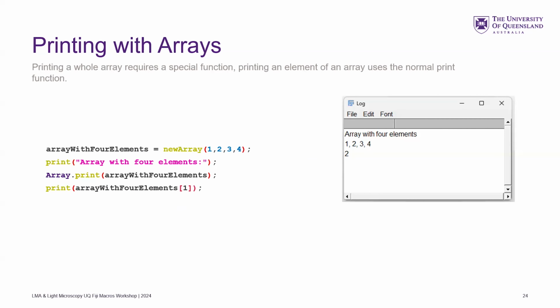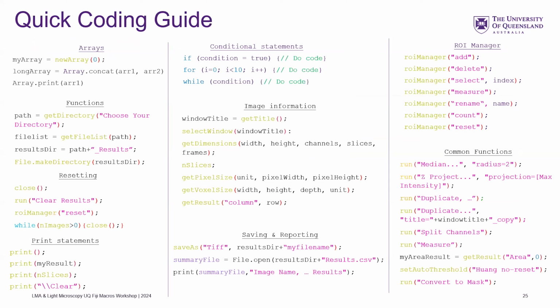I've given some printouts of these cheat sheets. These are all the really common stuff. These are the stuff that you'll come across in the workshop. So they're there, they're in the folder. I can't list every command that Fiji can do because it can do a lot. And there's new stuff being added all the time. And there's tricky ways you can do stuff. So these are the common ones that you'll come across.